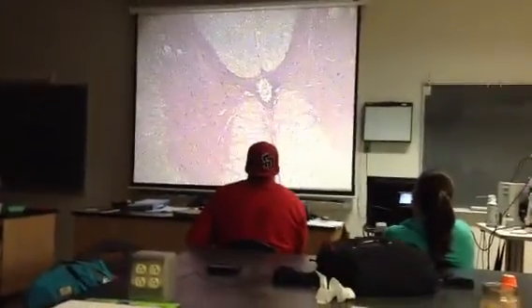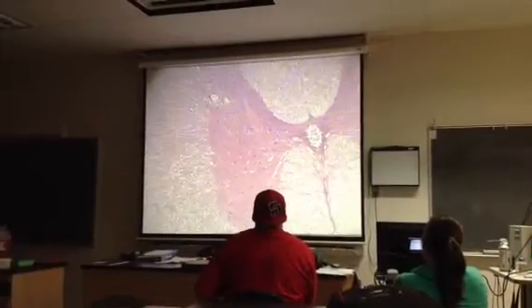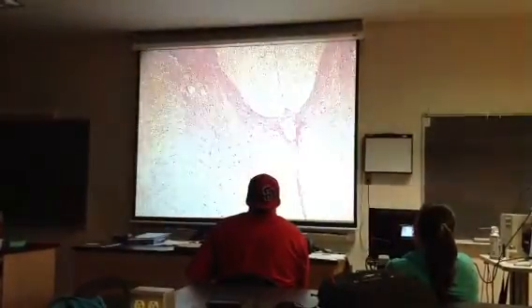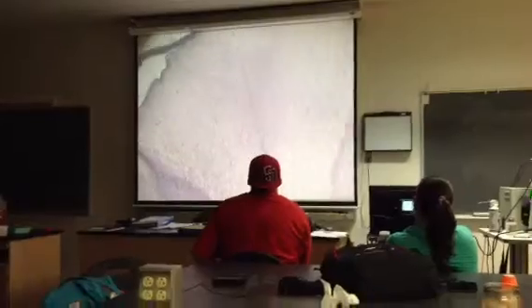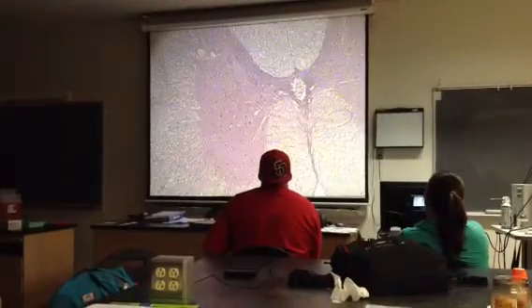You'll be able, with the dissecting scope, to see a little bit farther away and you see more of the image all at once. What is this organ that we're looking at here? Spinal cord? Yeah, this is spinal cord. Okay, nervous system organ. And so if you scan, okay, I see a space right here.